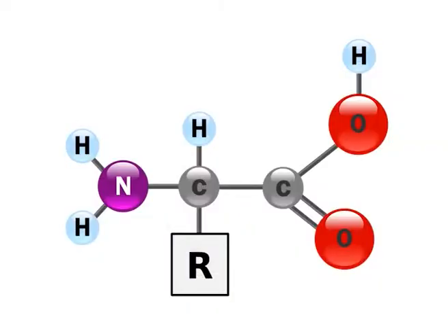Ninhydrin is particularly useful for developing fingerprints on porous and absorbent surfaces like paper, paper products, cardboard and wood, whereas the inorganic ions and most of the organic ingredients of sweat deposit tend to interact with the cellulose content of paper or wood. The amino acids remain inert. Moreover, with passage of time, the amino acids do not migrate within the capillaries of the substrate. Therefore, the Ninhydrin method makes it possible to develop fingerprints that are many years old.